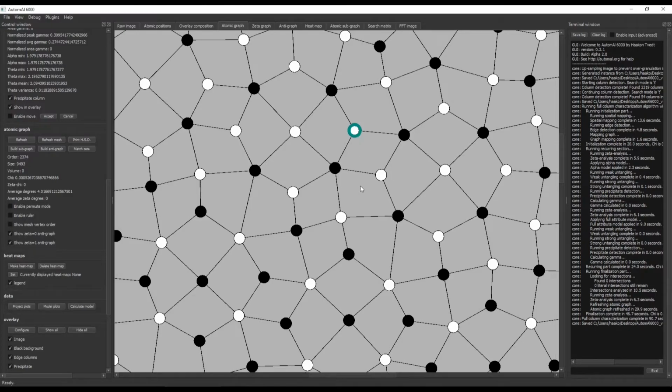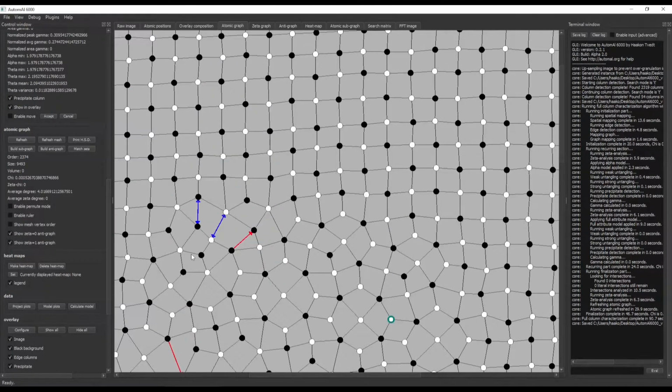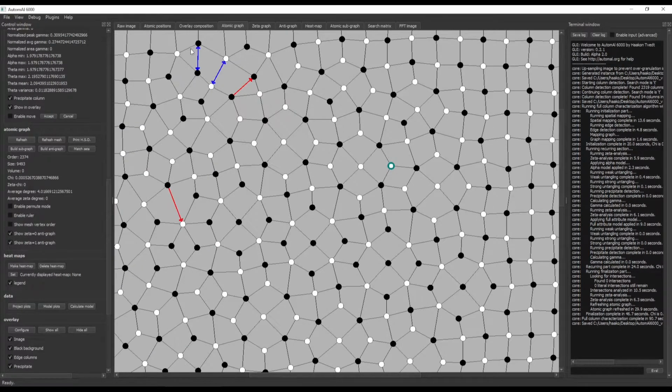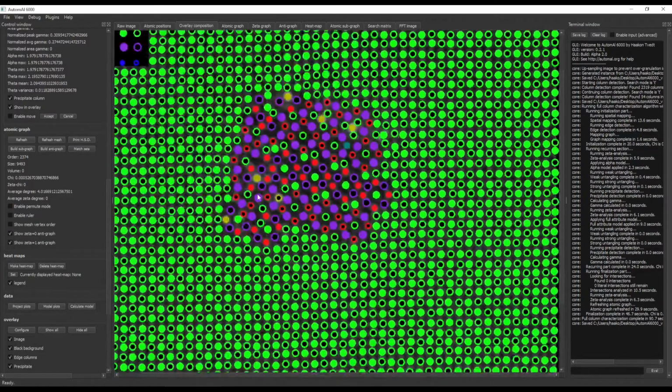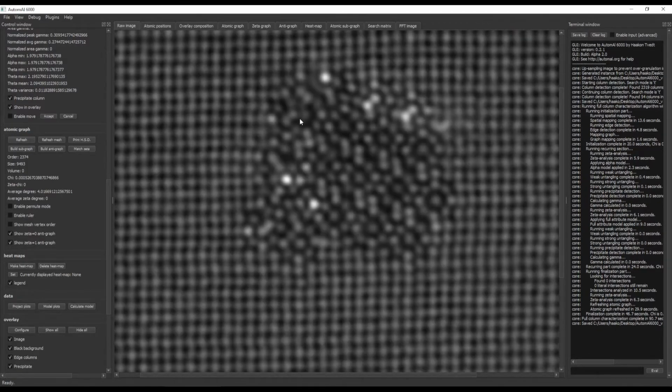So the final step in the review of the result would be to check that all the copper are labeled as copper. Of course, you would clear out this area first, but I'm just going to go ahead now and show you how I would do that.